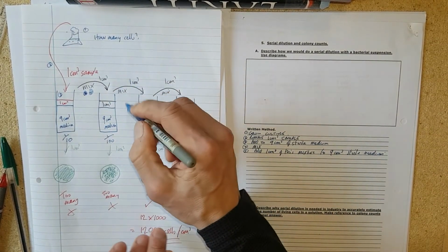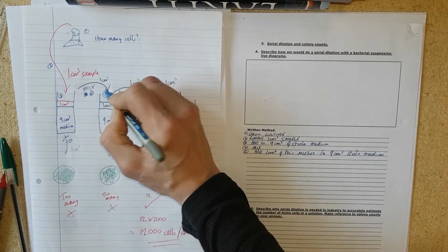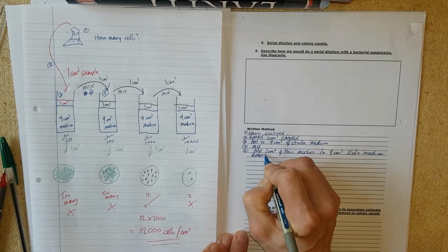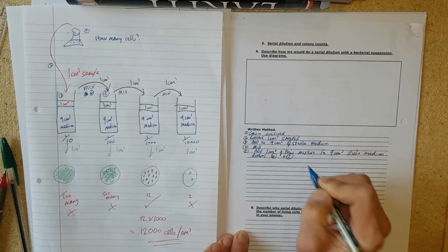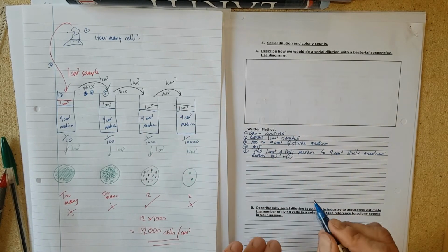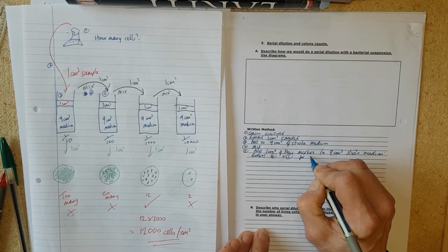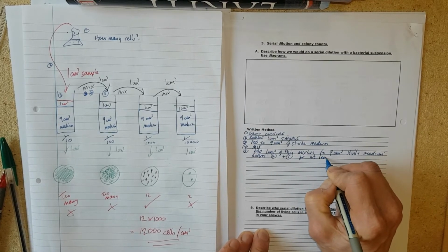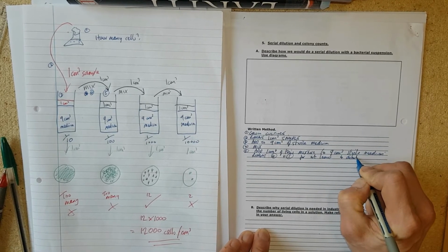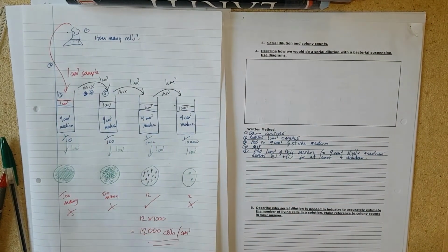And then we've got another repeat 4 and 5 for however many, say another 3 dilutions, for at least 4 dilutions. Quite often they do one. So we've got our original culture, and then we've got 4 dilutions of it.